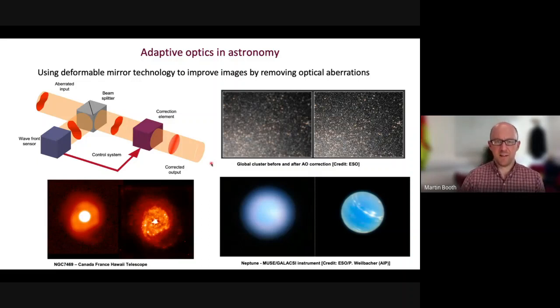Now, this method of using a wavefront sensor is sometimes applicable to microscopes, but not always. It's to do with the difficulties of being able to measure wavefronts when you've got a three-dimensional object and you've got light coming from many points within that object. And so, although this can be used in certain microscope configurations, we've developed other methods based around what we call image-based or wavefront sensorless adaptive optics in order to control most of the microscopes we've implemented.